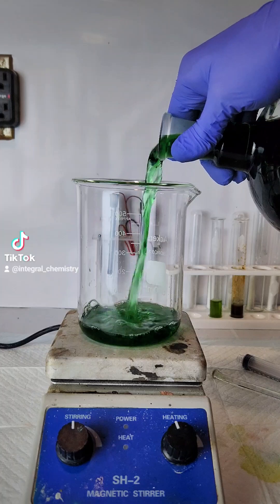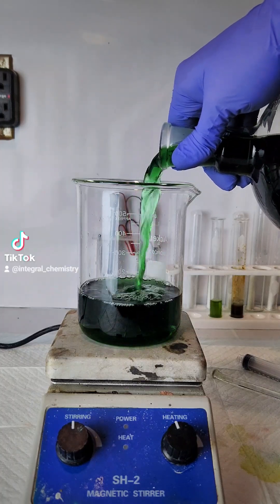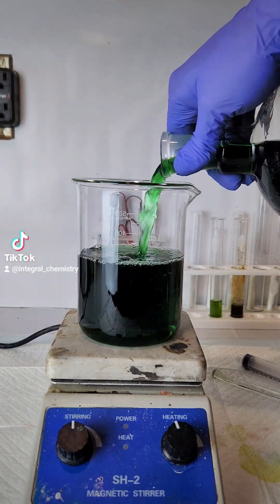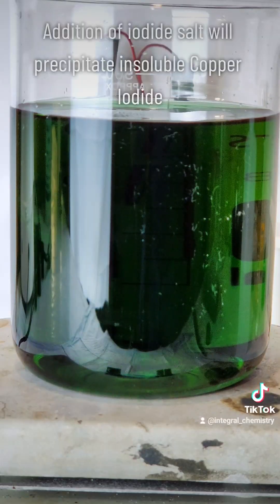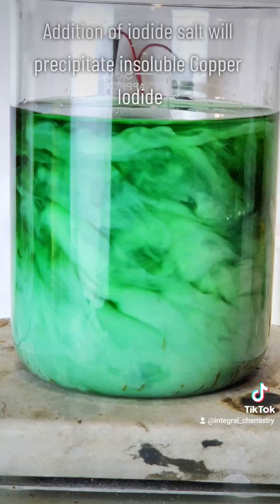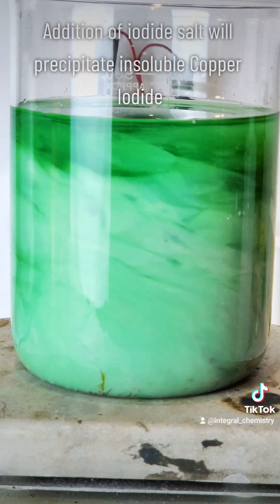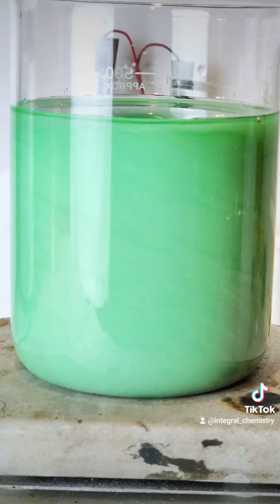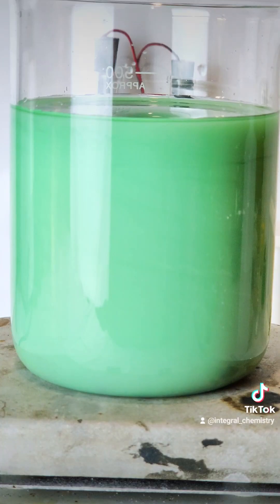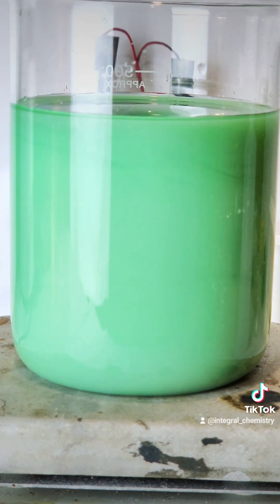To make my copper iodide, the first thing I do is pour my resulting filtrate out into another beaker. To this I'm going to add some potassium iodide, which will immediately precipitate insoluble copper iodide. No nickel iodide will be precipitated even though some is formed in solution, because nickel iodide is very soluble in water. Copper iodide will also settle to the bottom like copper chloride, but it takes a lot longer.